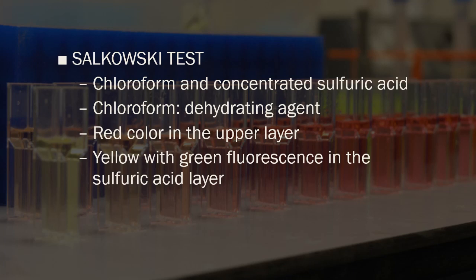If you're going to test your pig's brain with your Salkowski test, remember that your pig's brain contains a lot of cholesterol, a concentrate of cholesterol present in the brain, and that is why your expected result for this one should be positive. You should have a red color or probably purple color for this one.